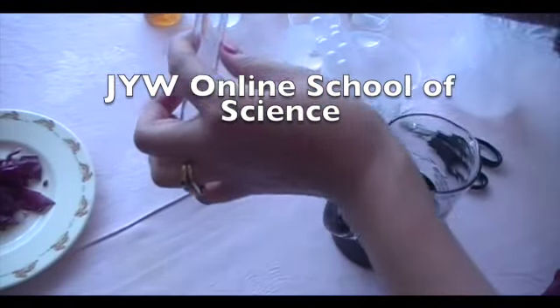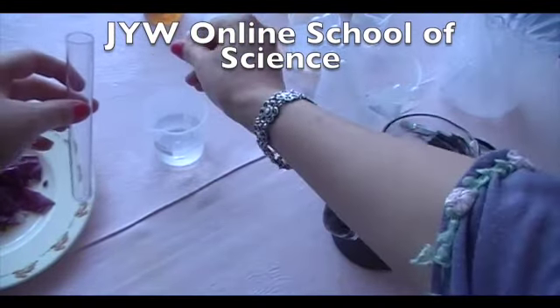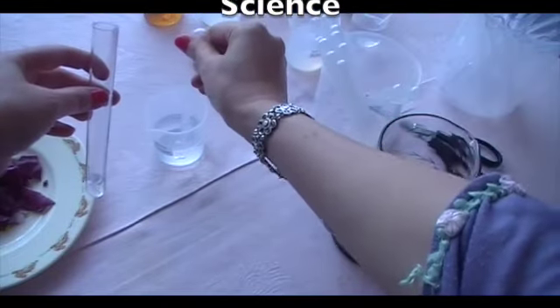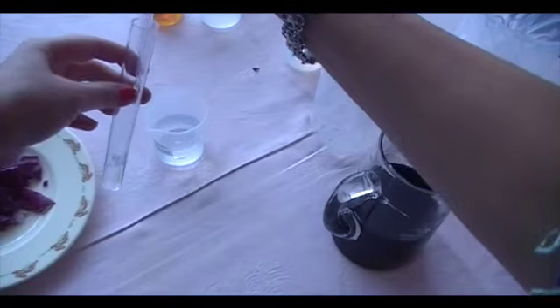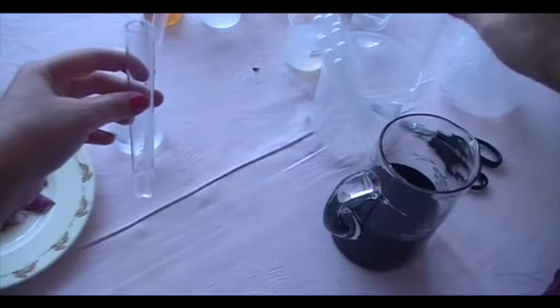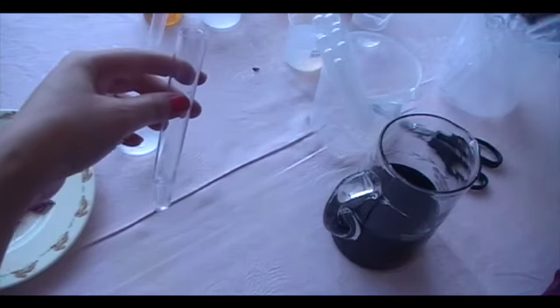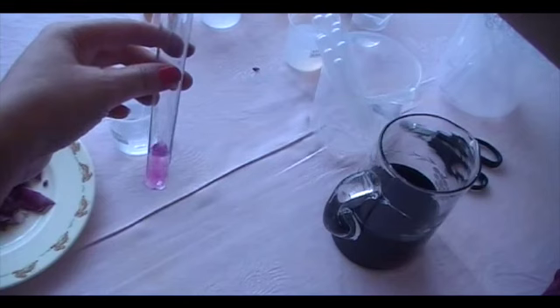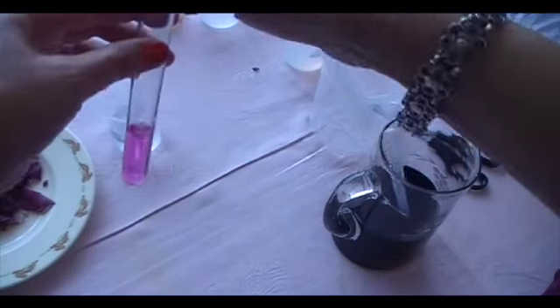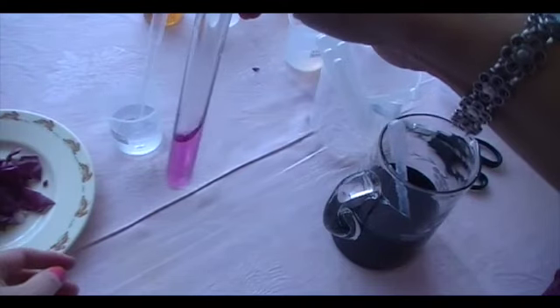So what I do is add some white vinegar into this test tube, and then I add some indicator. This is a red cabbage indicator. Add it in. You see the color? It turned red. That means it's acidic. It's acid.